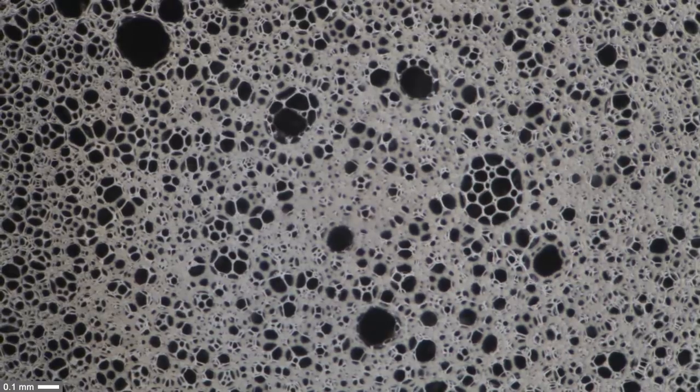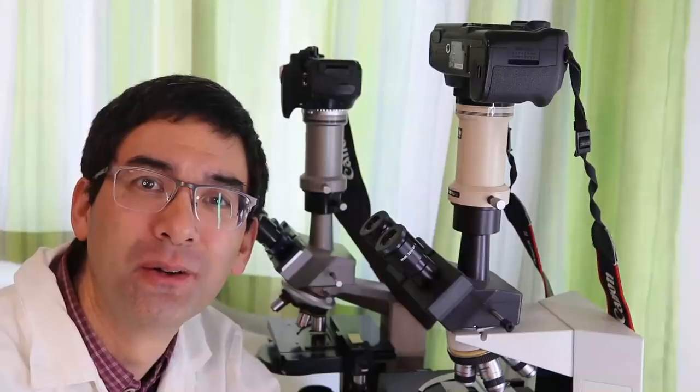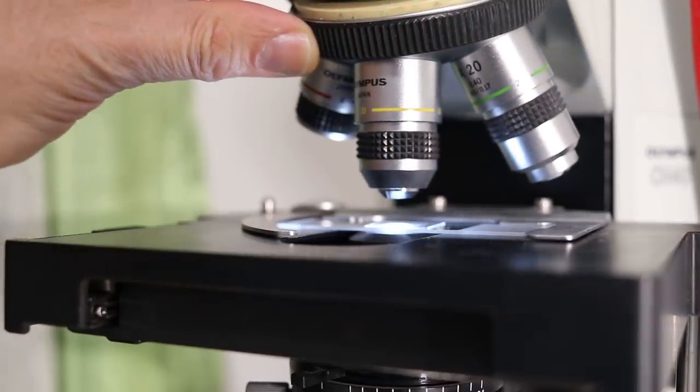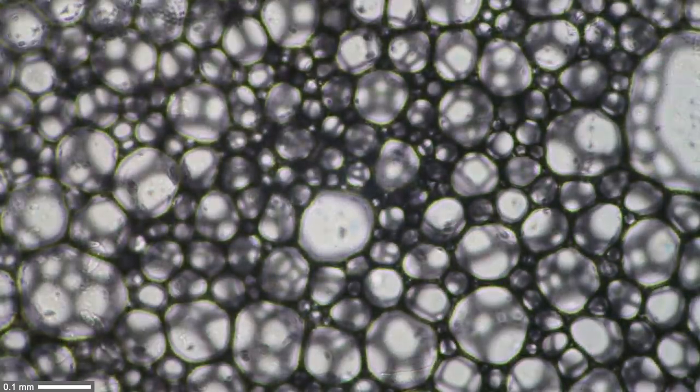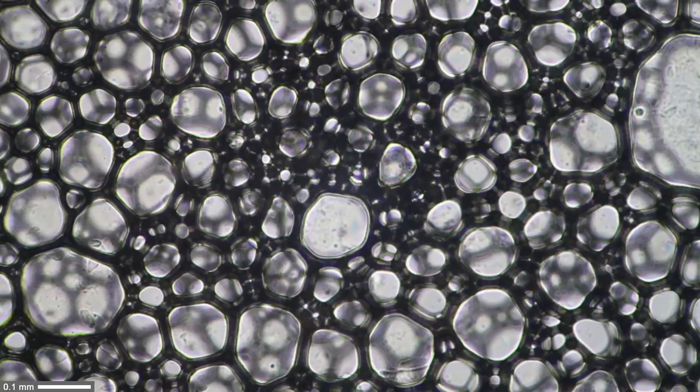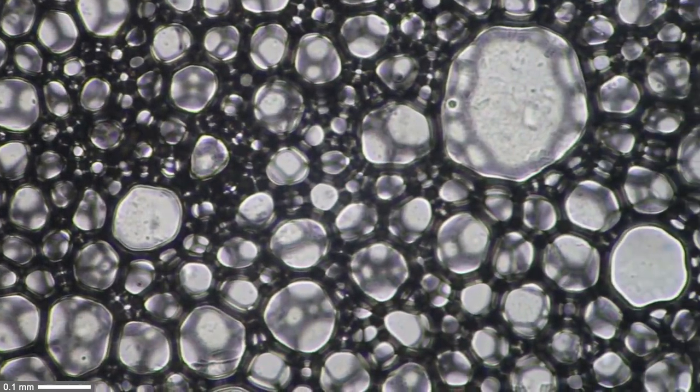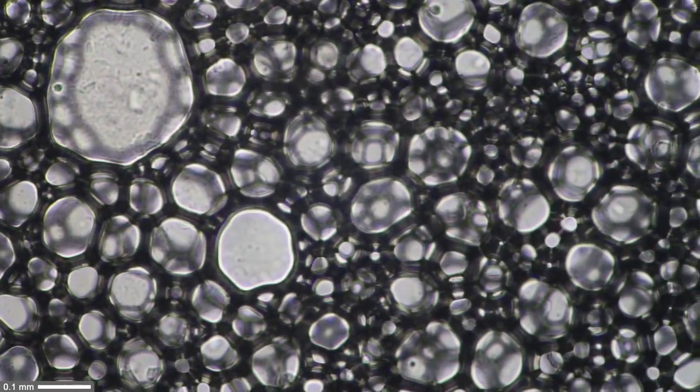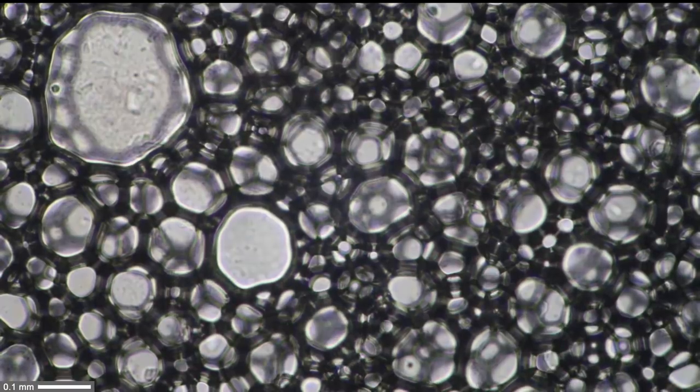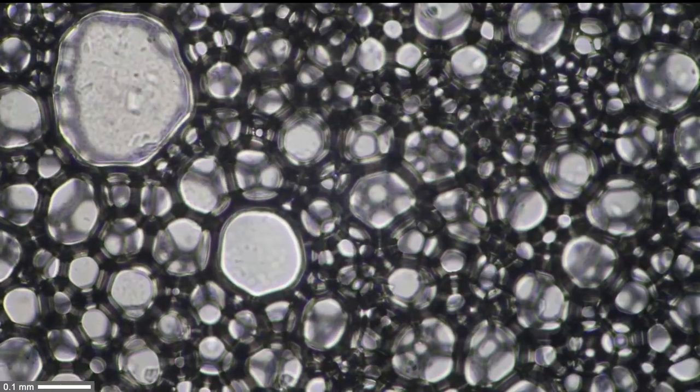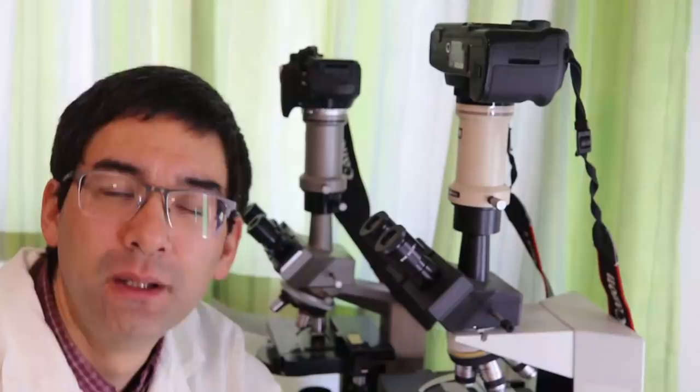And that's quite an interesting thing to see how the foam bubbles are white on black background. Well, let's switch now to a higher magnification and let's have a look at it using my 10 times magnifying objective. And I think I'm just not going to say anything right now. I'm just going to let you enjoy collapsing foam.